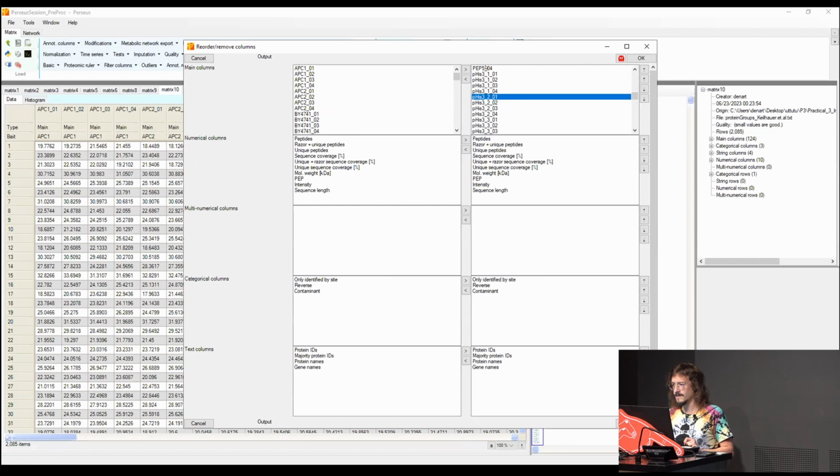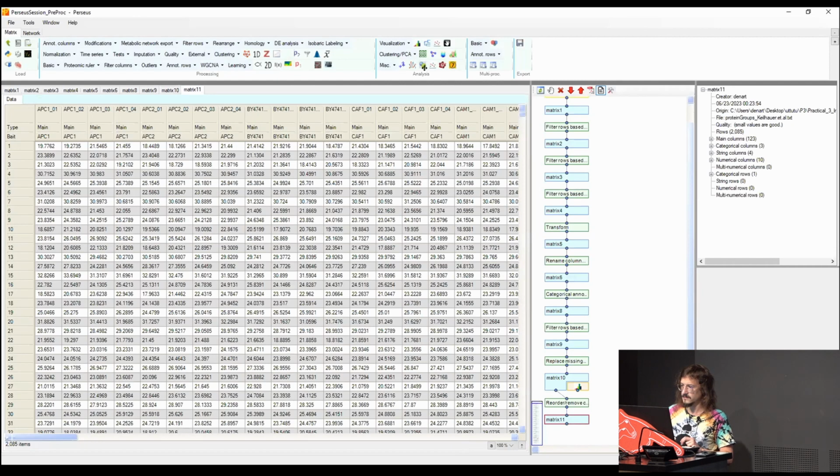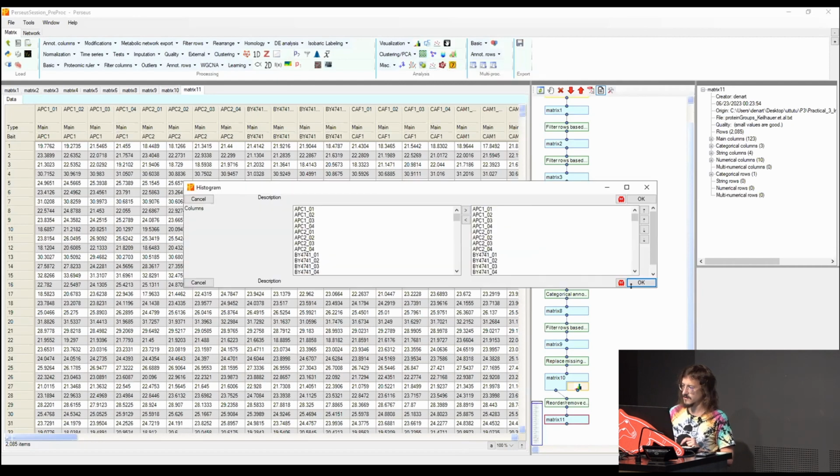So here on this part of the table, you have all the information that you want to add. And if you want to add, you move them here. And here, there is all the information that you already have in your matrix. If you want to remove them, you then bring them to the other side. That's it. And here also categorical, numerical. Let's see now if I removed the correct one.